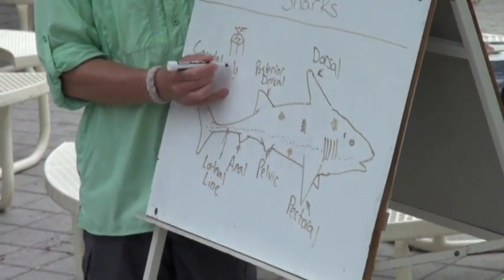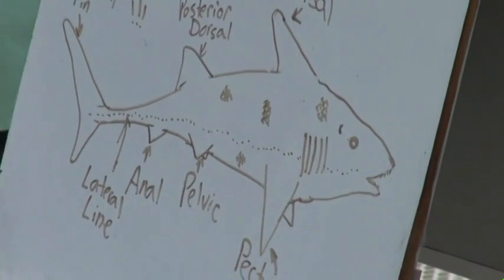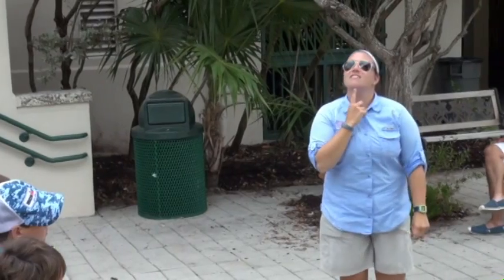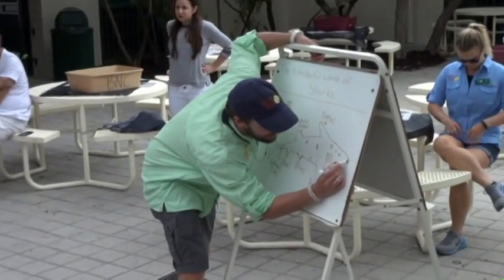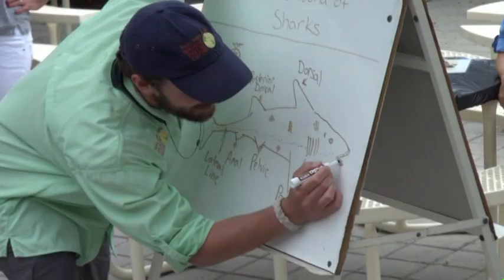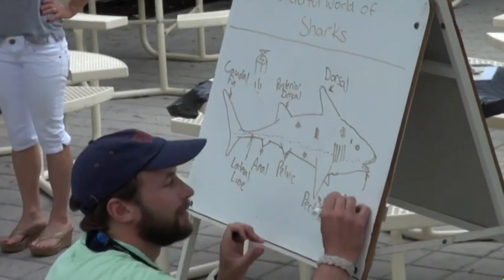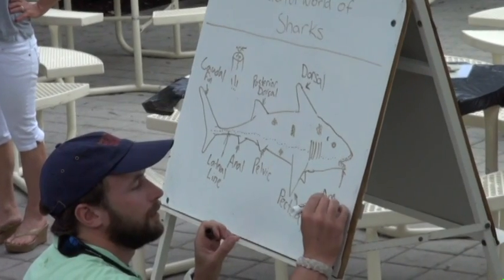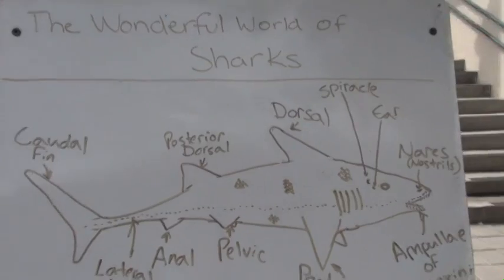Now, sharks take it one step further. Instead of having 6 senses, they have 7 senses. They actually have one, and that's this one right here that they use for feeding. It's called the ampullae of Lorenzini. Okay, and it's obviously named after a biologist. Obviously. An Italian biologist who actually found out that when you look at a shark, and we'll be able to see it, when you squeeze their chin, little jelly-like stuff comes out of these pores, okay?